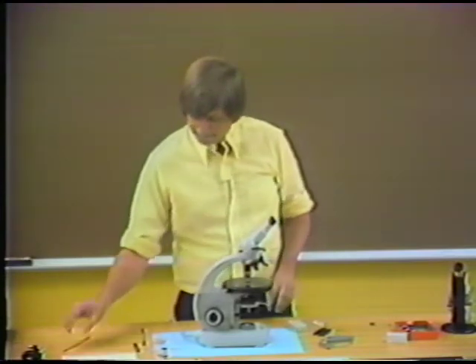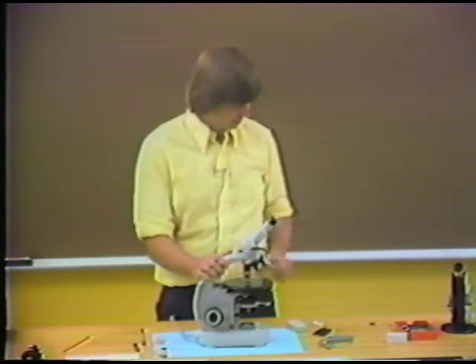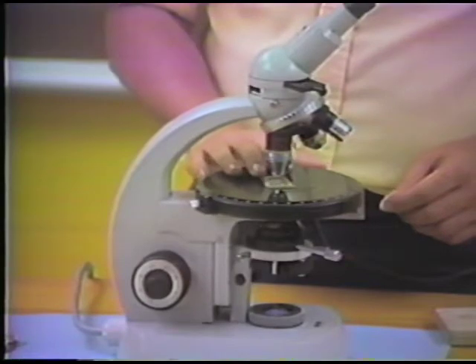Okay, second thing I want to do is to demonstrate how one centers an objective. In order to do this, I'm going to put my granite thin section back on the stage of the microscope, and look at this granite thin section again with my medium power lens, and here we are looking at it in orthoscopic view. I'll rotate the stage here, and you can notice that this rotation shows that the slide is not at all centered. In fact, there's a biotite grain at the center of the field of view that's located way in the northwest corner in this kind of position.